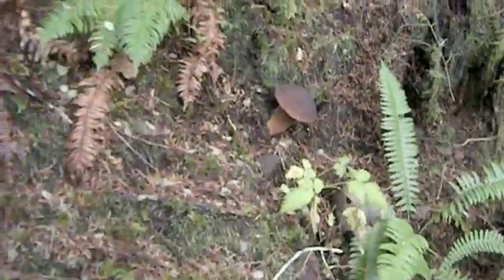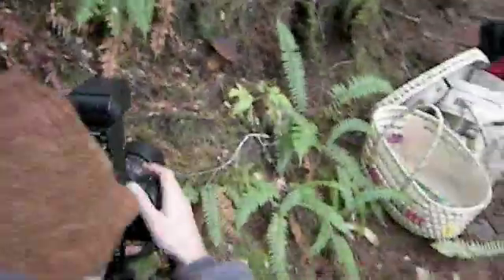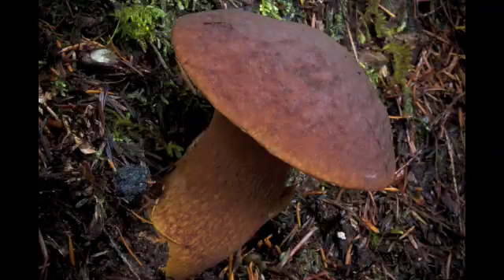When collecting new specimens for DNA barcoding, the first thing you want to make sure you do is get a good photo of it in the field.